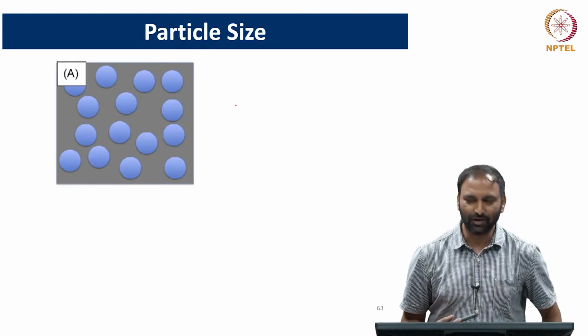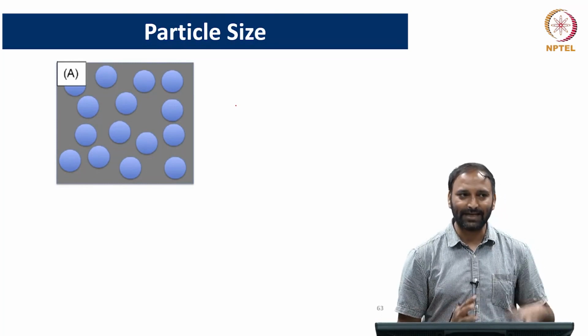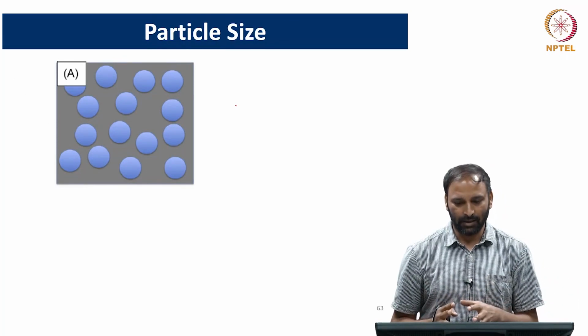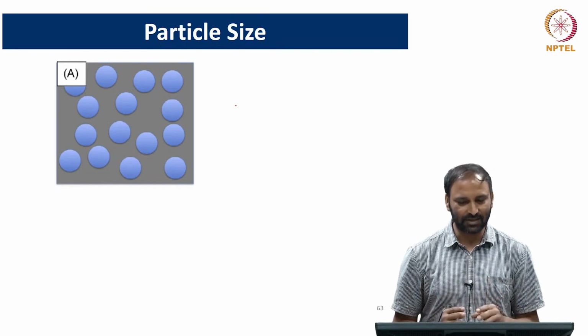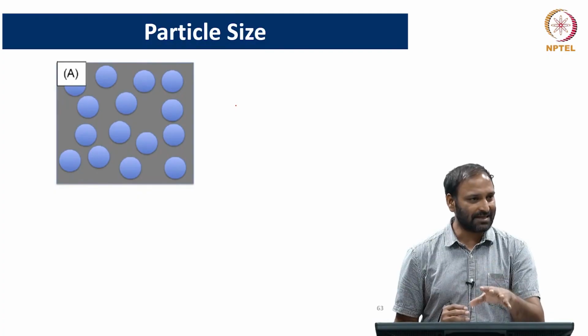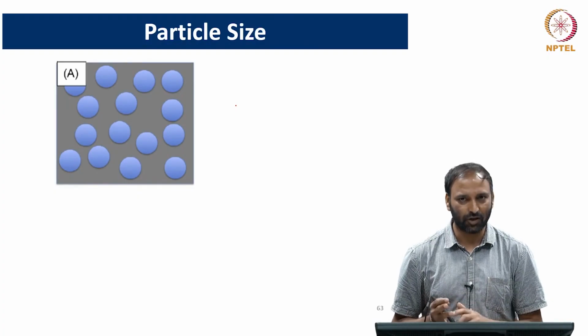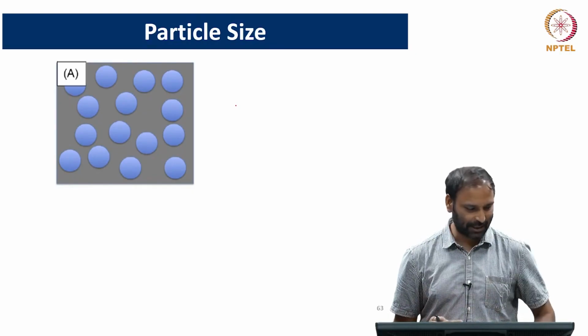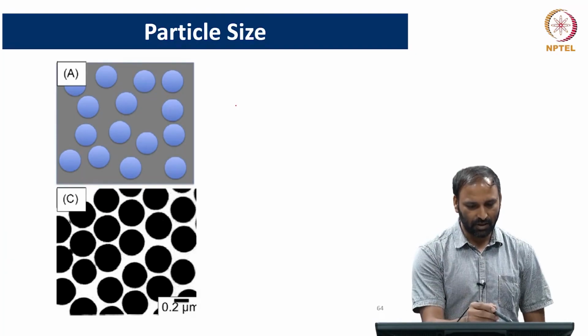I had mentioned that there are several techniques available for characterizing particles, light scattering based and microscopy based, in which we briefly discussed dynamic light scattering, static light scattering, and in terms of microscopy there is optical microscopy and electron microscopy. So all these techniques can be used.